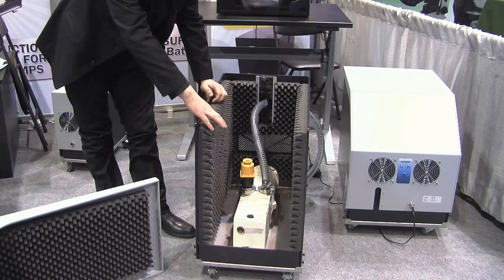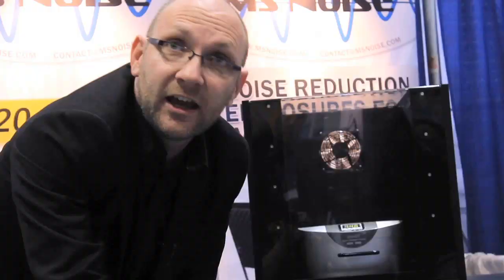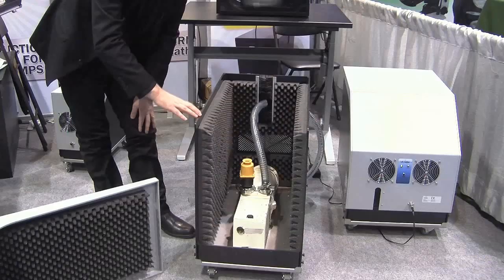The noise enclosure is made of five centimeters of polyurethane foam, fireproof to comply with regulation, and the design of the main frame is ABS. We do not want to work with a metallic design because we could have issues with vibration.